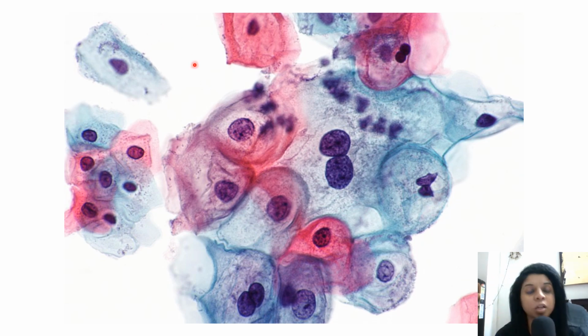or anything that is a scenario of infection alone, it is not that you put the slide to see only for trichomonas or candidiasis or anything. What is the purpose of pap smear? Pap smear is done to find out whether there is squamous cell carcinoma or squamous intraepithelial lesion or not. So pap smear is for cervical cancer screening.